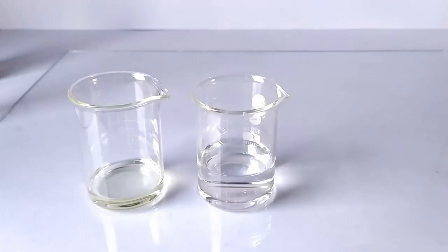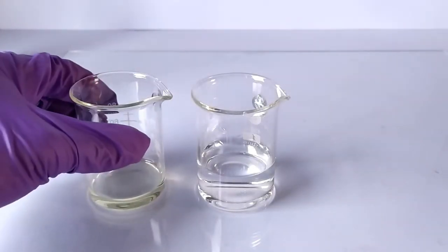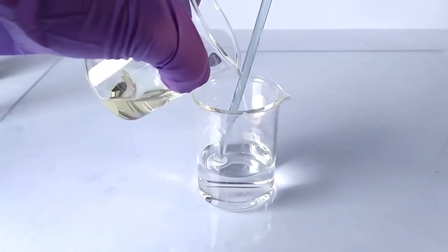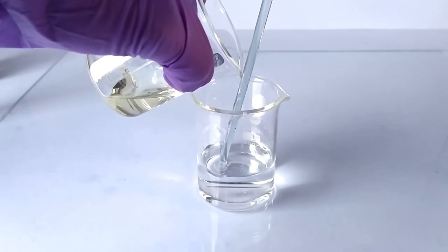Now take the beakers containing the dissolved mercury chloride and the potassium iodide solutions. Slowly and carefully add the iodide solution to the mercury chloride solution with intermittent stirring.